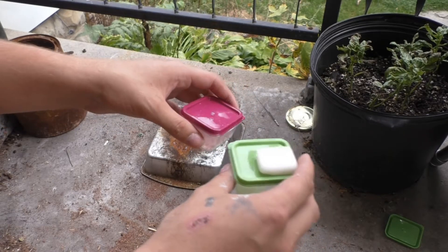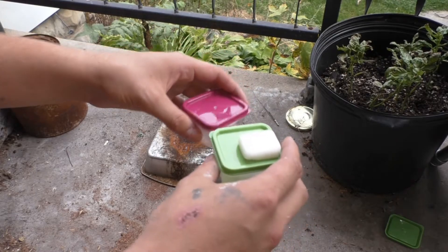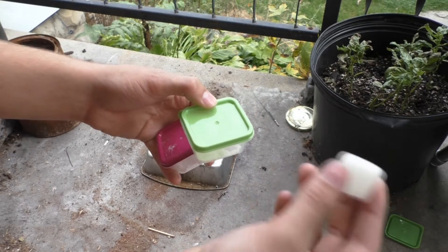Hello guys and welcome back to PCRT, or potassium chlorate reaction test. It is of course me Trollface the man, and today we are going to test hexamine tablets — those tablets you get for camping.